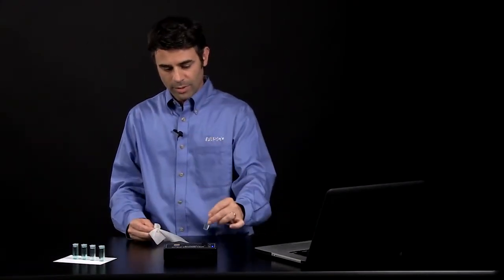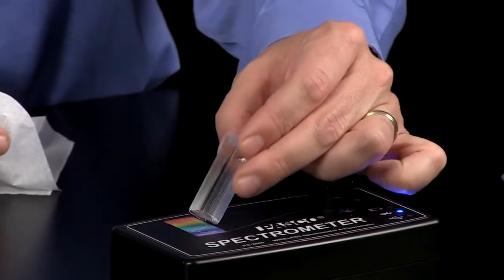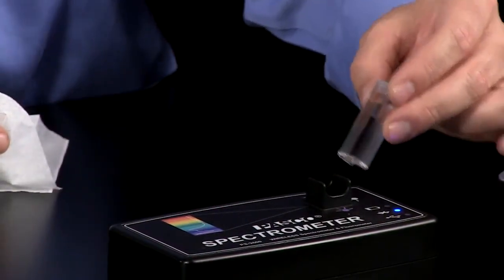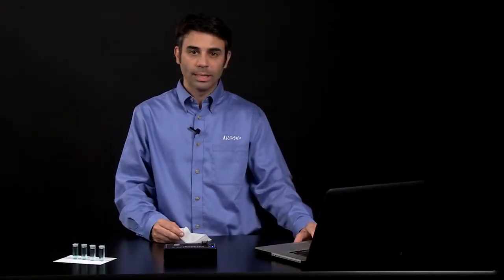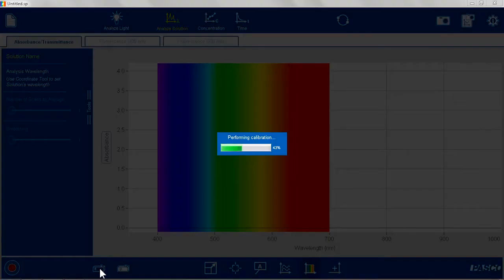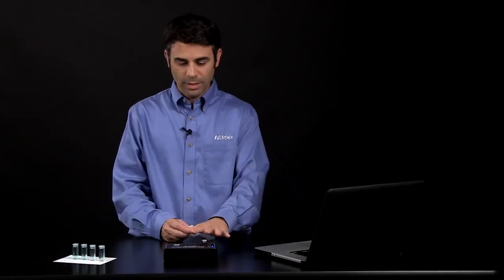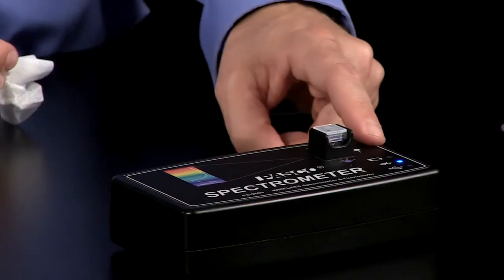I am going to make sure the sides of the cuvette are clean, putting the clear sides of the cuvette towards the detector and the light source. I am going to blank my cuvette using a dark reference, which turns off the light in the spectrometer, and a light reference, which turns on the light to allow all that light through the solvent — in this case water, the blank solvent.